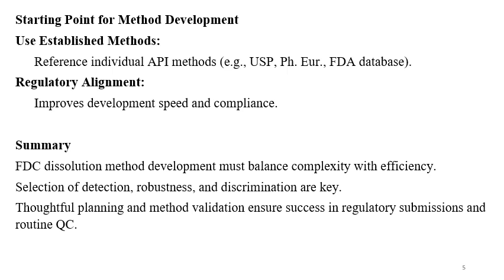FDC product dissolution method development must balance the challenges, complexity and efficiency. If 3 components are there, for example, and you are using separate dissolution methods, then for every batch 3 dissolutions are required to be done. Also, 3 dissolutions will be required on the stability samples. So it will become very difficult. Also, there are chances of failure.